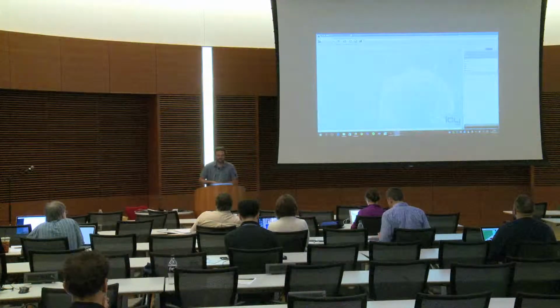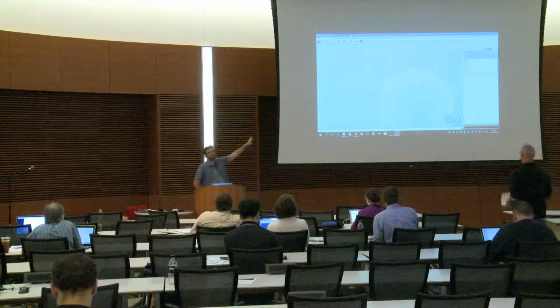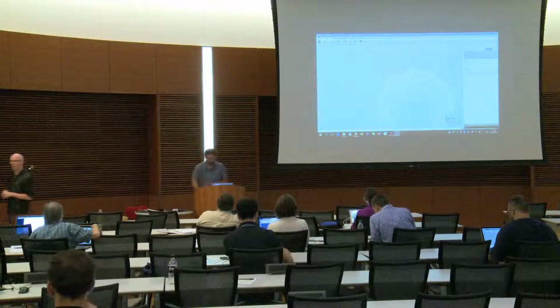Does everybody have IC downloaded and launched so that you can have this view on your computer? Please raise your hand if it's done, or very few people. If you have any problem, just raise your hand. I tried to download some sample files, but I couldn't see the URL.